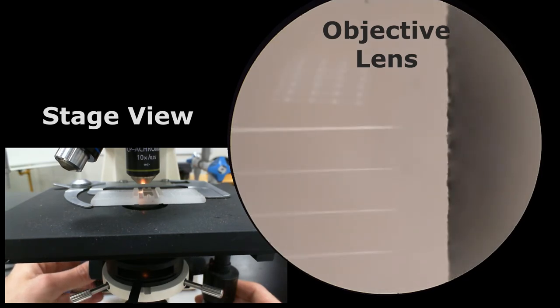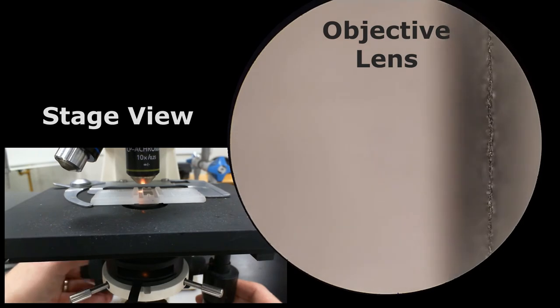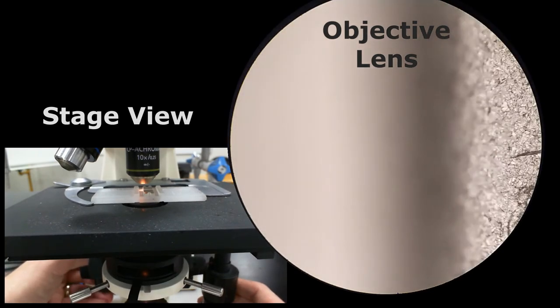Now remember, everything under the microscope is reversed. Even though on the actual slide, when I'm looking at it on the stage, the counting chamber is to the right and the trench is on the left, when you look at it through the microscope, you're going to see that the trench is on the right and the counting area is on the left. Everything's reversed under the microscope.